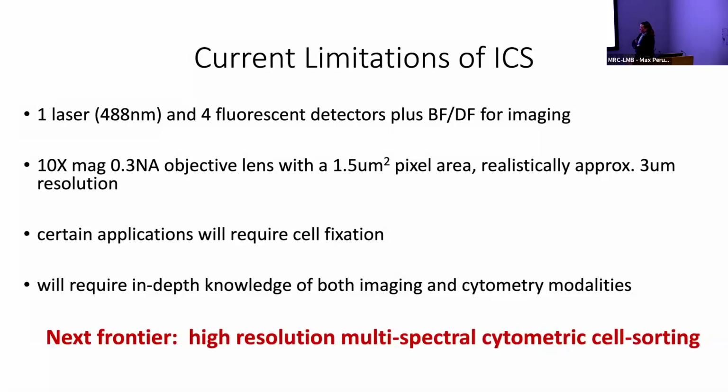And as we move forward with these kinds of technologies, it's going to really require more in-depth knowledge of both imaging and cytometry modalities. So I anticipate that the flow cytometry and imaging community will have to work more closely together to ensure that all of the technical experts going forward will be trained appropriately in both techniques. The next frontier is really high resolution multispectral cytometric cell sorting.